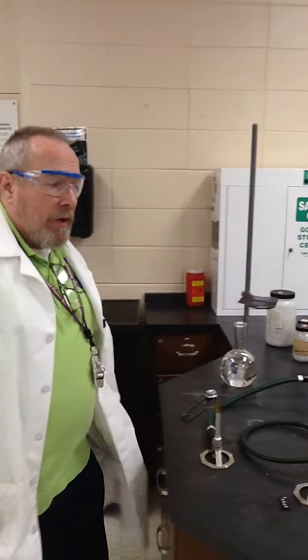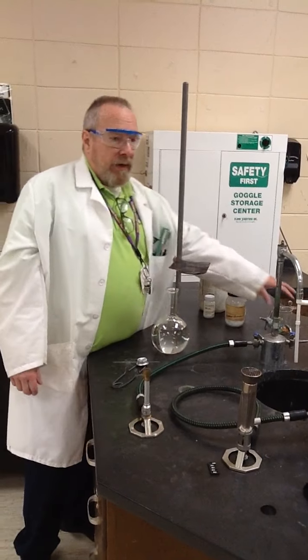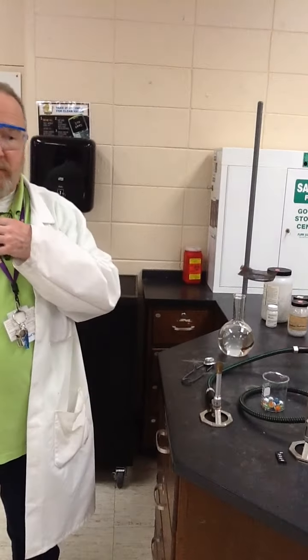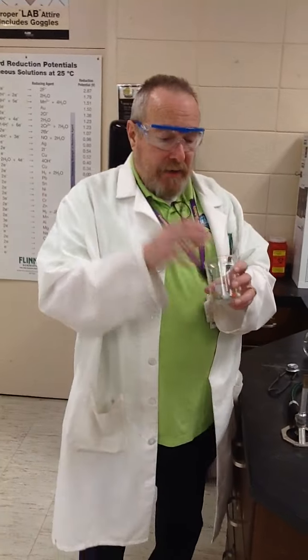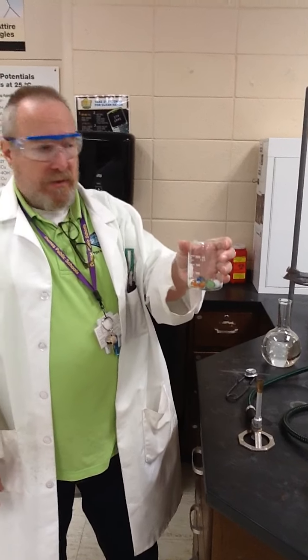So in every lab, we use one of a few things. One of them is boiling chips, and another one is glass beads. Excuse the bell. So, I thought I had my glass beads out. I don't see them, but they're just small clear glass beads. And in my past, I have also just used plain old marbles from Dollar General to provide additional surface and places for the gases that are being driven out of the water, or for the water vapor itself that's being generated from the heat to nucleate, form a bubble, and escape.